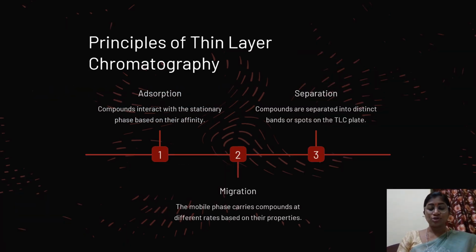Principles of thin layer chromatography. In thin layer chromatography, adsorbents like silica gel, alumina, etc. are supported as thin layers on glass plates. We also call these chromatoplates. This technique is similar in some aspects to both column and paper chromatography. Just as in column chromatography, the moving substance is attracted by the polar sites on the surface of the adsorbent by electrostatic forces. This binding is reversible.